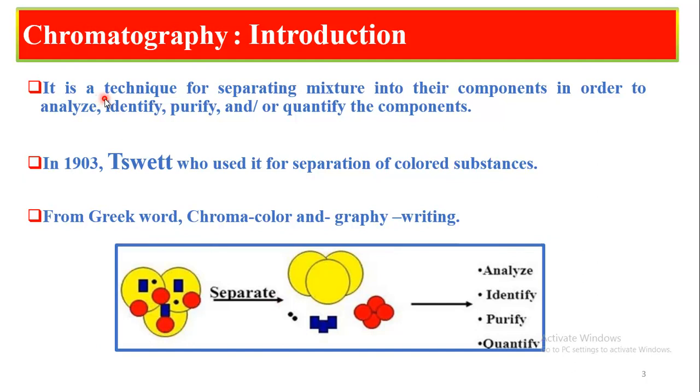Here I have written a definition. It is a technique for separating a mixture into its components to analyze, identify, purify and quantify. That is called chromatography.